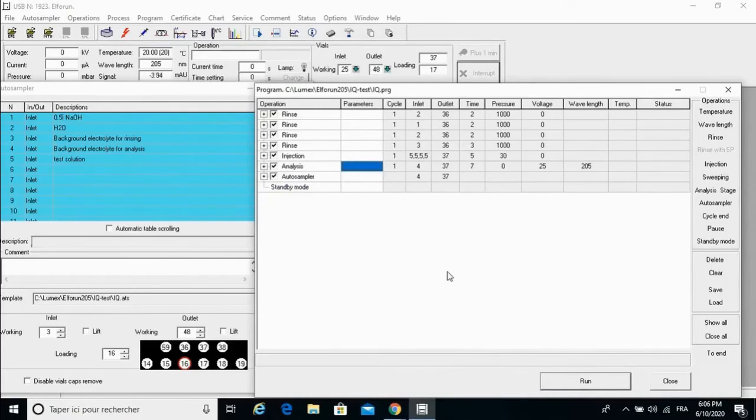Don't forget also to turn your lamp on for 30 minutes. And that's the first thing I do when I walk in the lab. I'm repeating it again. I'll actually turn the temperature on and then turn the lamp on. If your system was powered down, then when you power it up, it'll actually turn the lamp on automatically, but it doesn't turn the coolant pump on. That only happens once you launch the software. All right, so we'll move on to setting up a run.